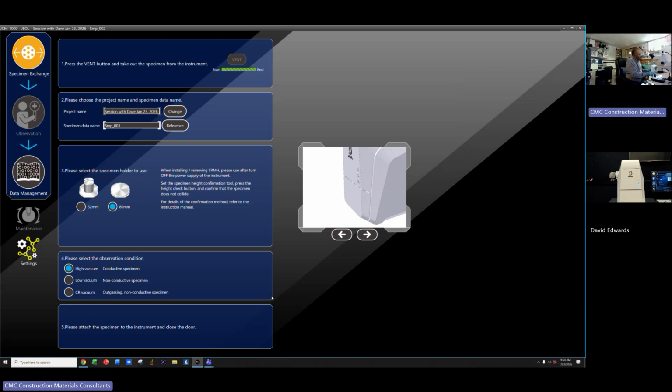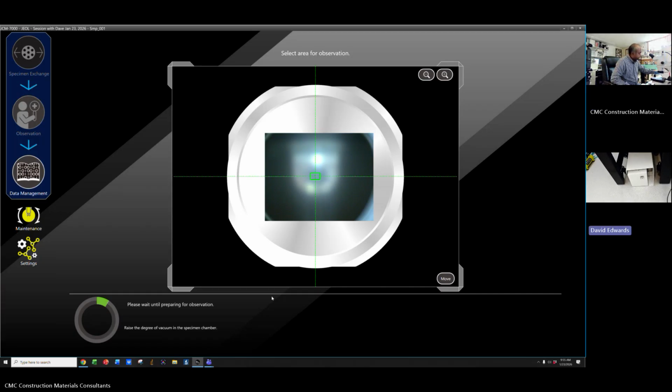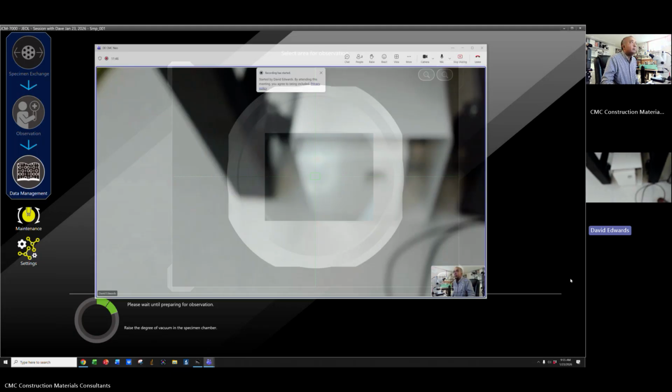I did power off my SEM. When I'm not using it for 3-4 days, I power off everything. By SEM I mean just the front button of the SEM, not the EDS or anything. I don't press the main power button below in the control box. I just press the power button in the SEM, and then the PC as well. So my recommendation, just as a last shot in the dark, is not just to power off the SEM itself, but to actually power off the box and to turn off your computer.